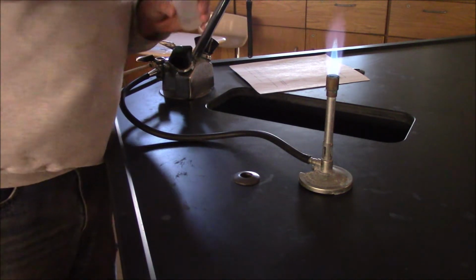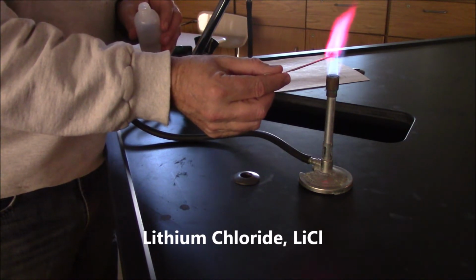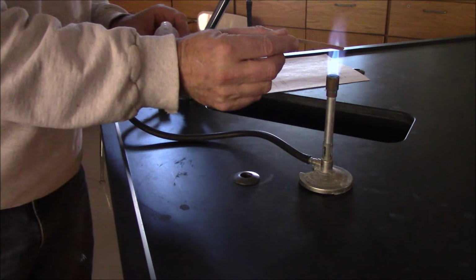Next is lithium chloride. Next is calcium chloride.